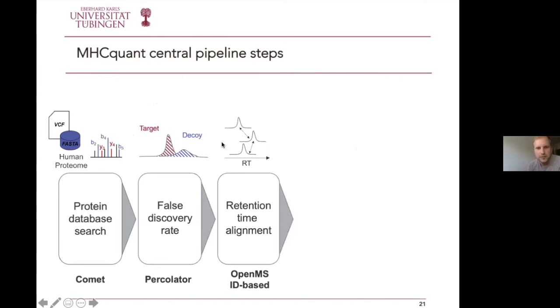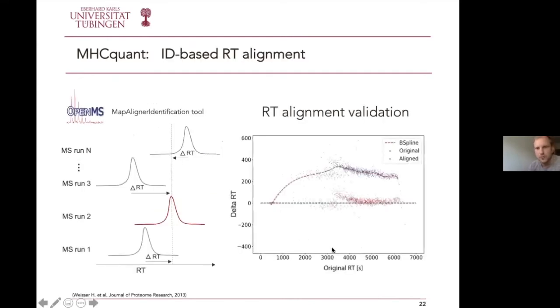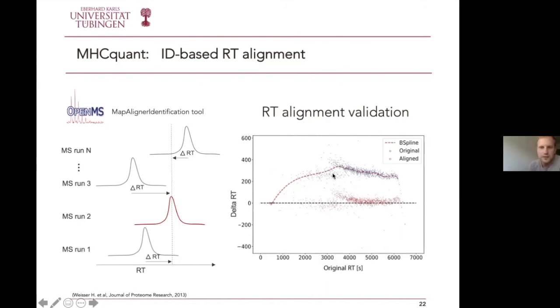The next step corrects retention time across all peptides. A known problem in mass spectrometry is that across different measurements, retention times slightly deviate. This is corrected in the pipeline using an OpenMS tool called MapAligner Identification, which aligns all peptides to one central reference. We verified this by looking at two very different MS runs, and the deviation was corrected to nearly zero across the entire retention time range after applying this tool.